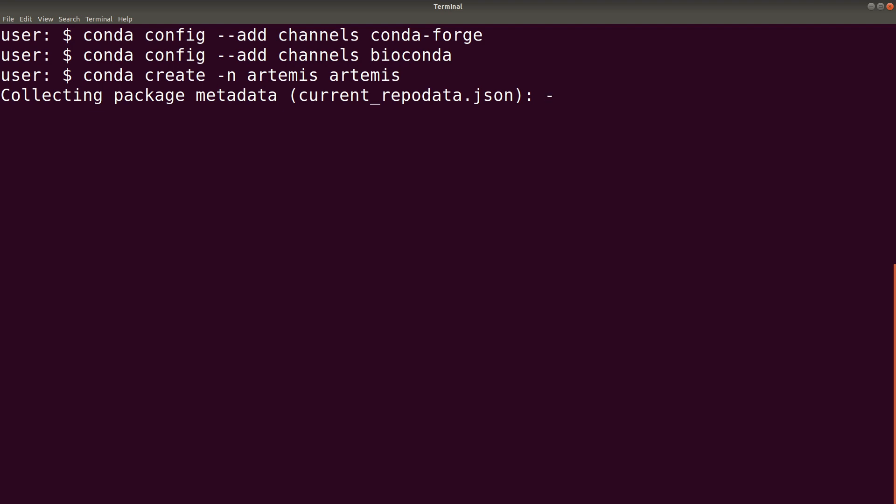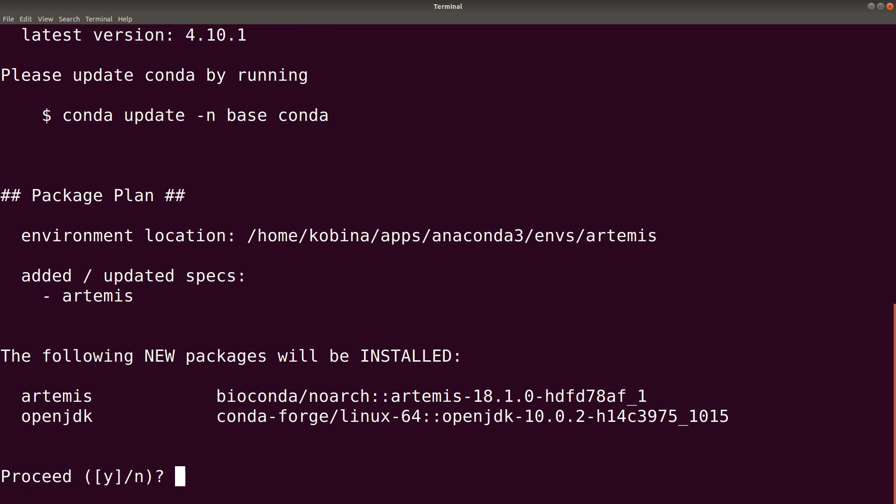So Anaconda will now start collecting the package and then also install all other dependencies for you. So you have to confirm. But one thing about Anaconda is that if it's installed in a package, it tries to install the dependencies.